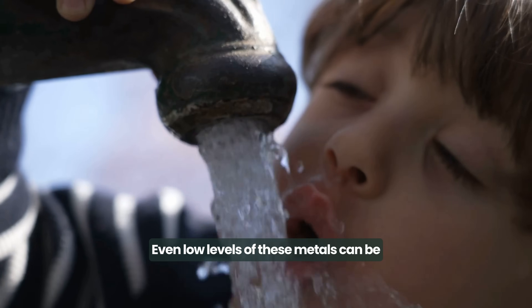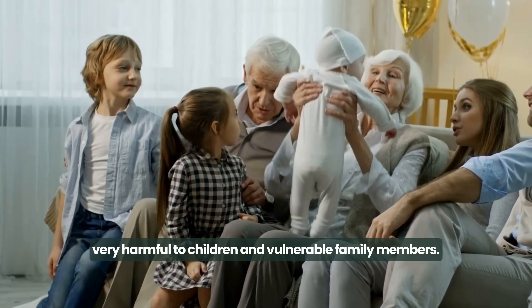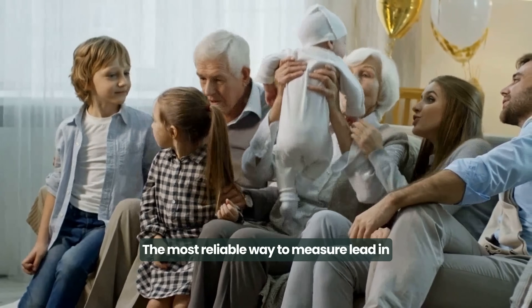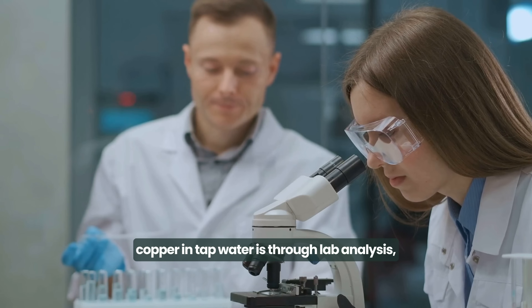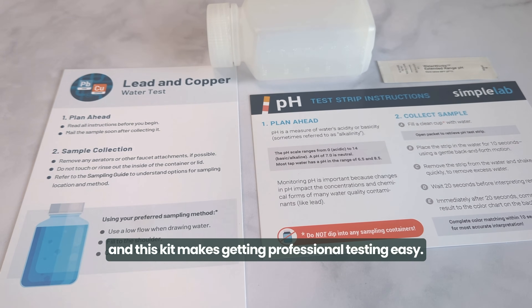Even low levels of these metals can be very harmful to children and vulnerable family members. The most reliable way to measure lead and copper in tap water is through lab analysis, and this kit makes getting professional testing easy.